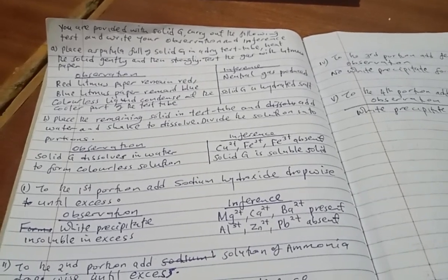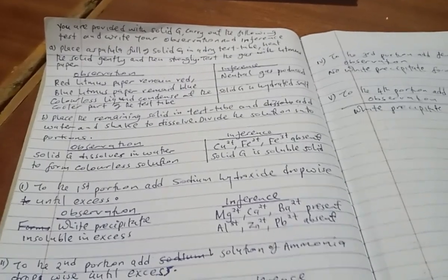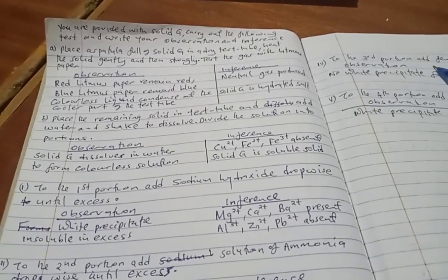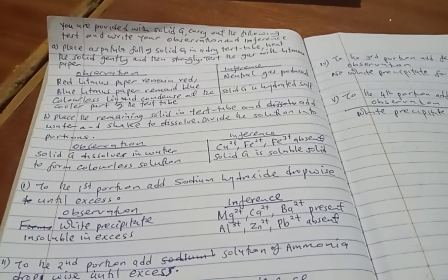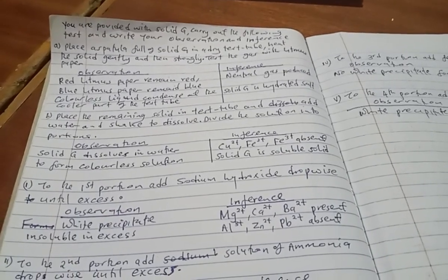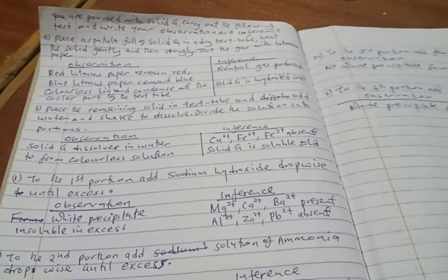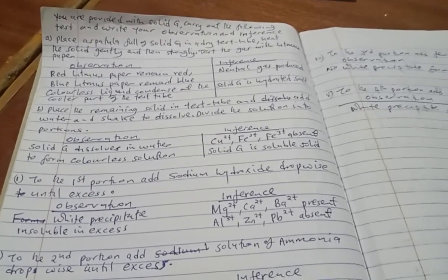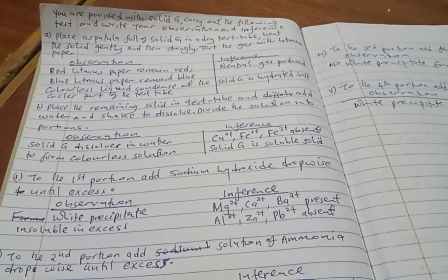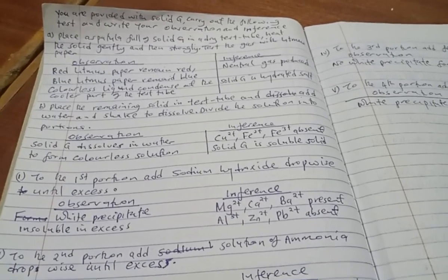So if they are not changing, then it is a little bit tricky, but it will depend on the question. If they don't ask you to test the gas, then under inference, you can just say a stable salt is present. A stable salt is a salt that does not decompose to produce gas. If they ask you to test the gas, then you have to tell us that the gas is neutral, so a neutral gas produced.